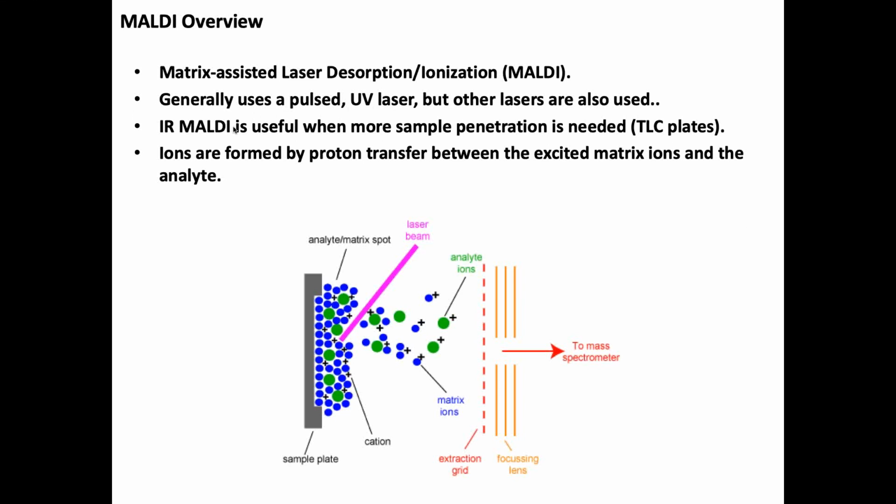Is it the charge on the ion that actually causes it to be pulled from the plate, I guess, and travel into the mass spec? Yes. In MALDI, I've whittled away a lot of the slides, so I'm not sure if I cover this, but MALDI is very different from electrospray. I got my PhD in secondary ion mass spectrometry, a very niche area. It's very similar to MALDI in that the majority of things that come off the surface are neutral. Ionization efficiency is fairly low.